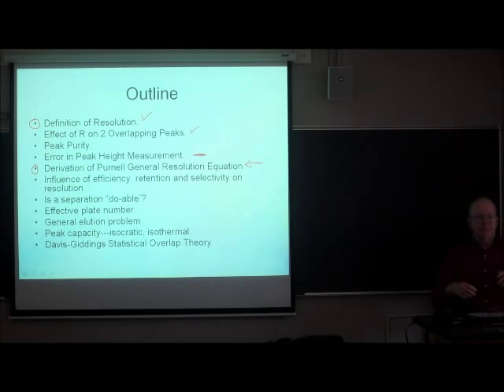Number one, is there enough retention? Number two, are the peaks sufficiently different in their position? And number three, does the column really have an adequate number of plates to do the separation? If you're working on the wrong variable, for instance, if the number of plates is already good enough, making it better doesn't generally help you.